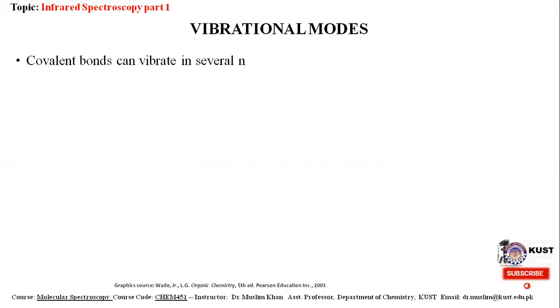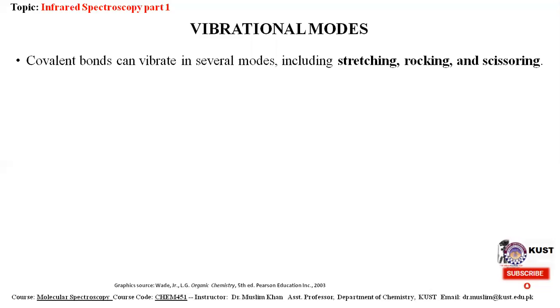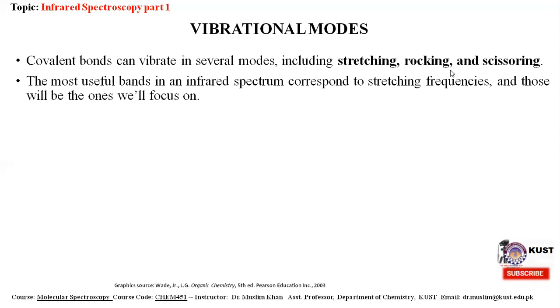So these vibrational modes, which are induced due to the subjection of these atoms to the infrared radiation, covalent bonds can vibrate in several modes, including stretching, rocking, and scissoring. The most useful band in an infrared spectrum corresponds to a stretching frequency, and those will be focused on in this lecture.